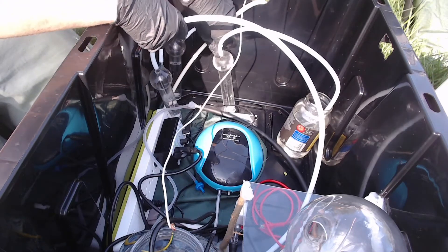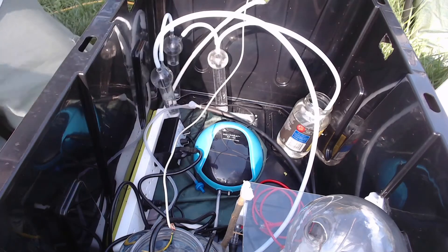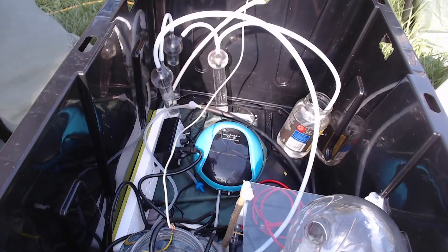Taking it from four scrubbers down to three, hoping that'll help a little bit with the flow restriction issues.